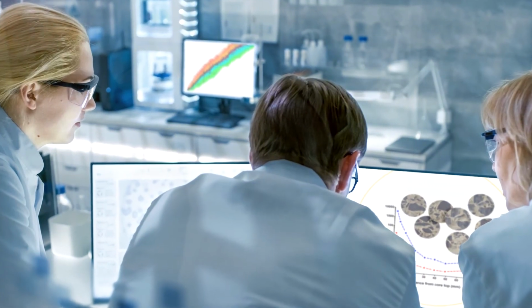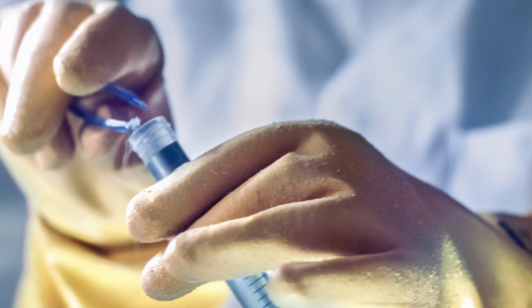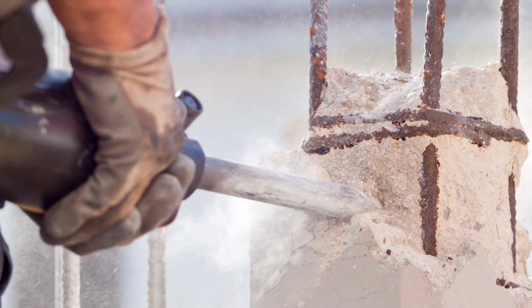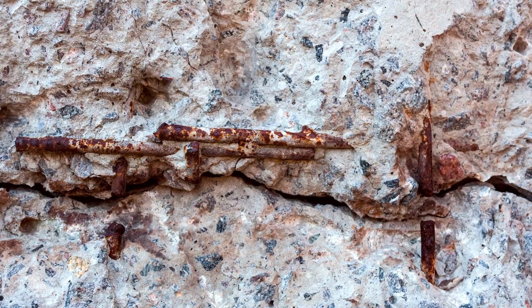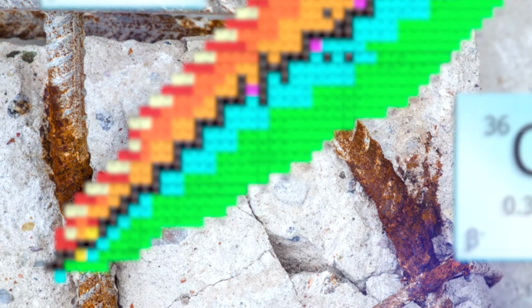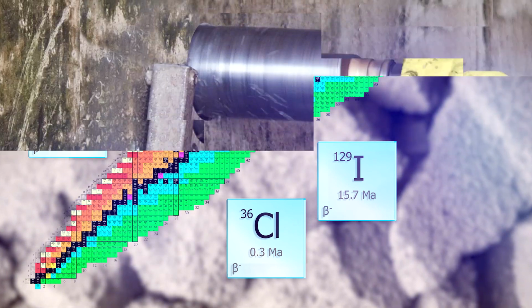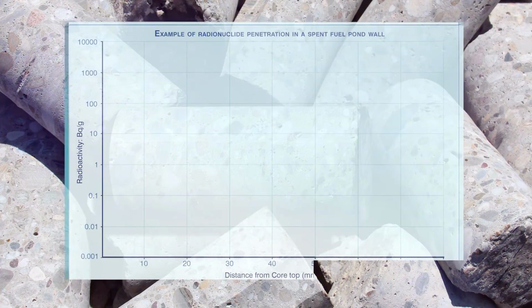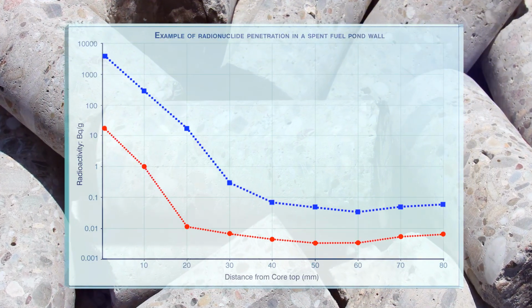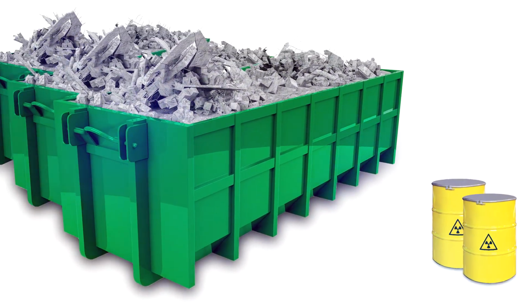The challenge for the industry and associated laboratories was to be able to process, sample and analyze the significantly increased volume of wastes generated during the dismantling of these plants. Meeting this challenge demanded innovative radioanalytical solutions to efficiently and accurately characterize radionuclides in the voluminous low to medium level wastes expected. This radionuclide characterization is a crucial part of the process of waste sentencing, as it guides which treatments to use that could lead to reductions in both the volume of radioactive waste and its significant disposal costs.